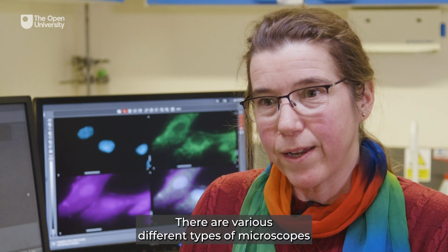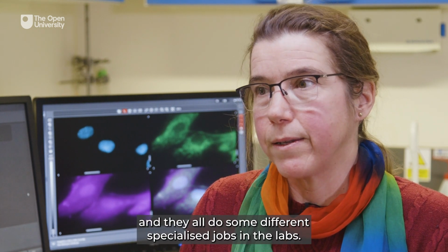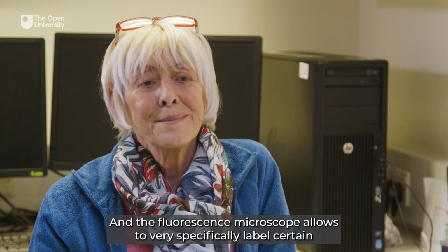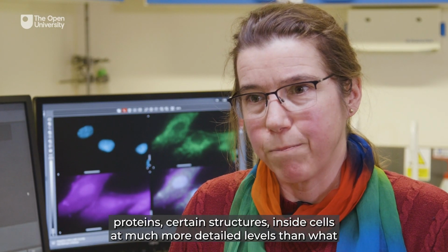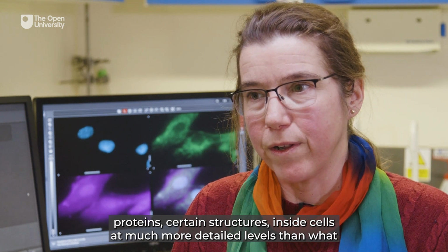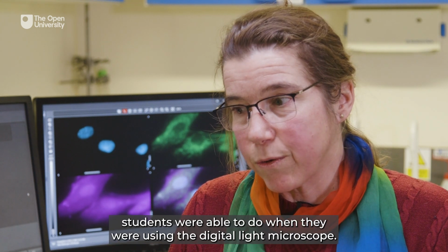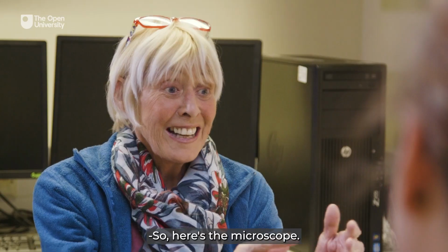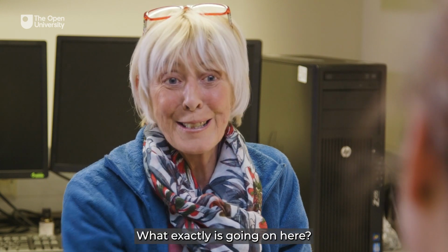There are various different types of microscopes, and they all do different specialized jobs in the labs. The fluorescent microscope allows you to very specifically label certain proteins and certain structures inside cells, at a much more detailed level than what students were able to do when they were using the digital light microscope. So here's the microscope. What exactly is going on here?